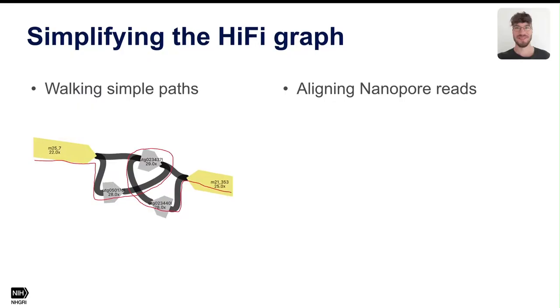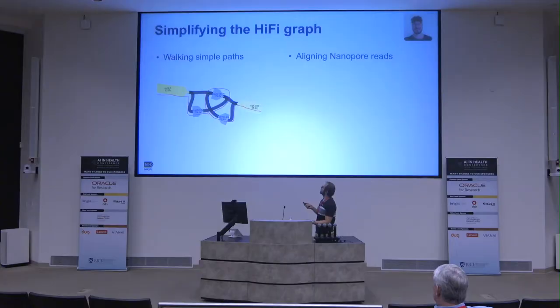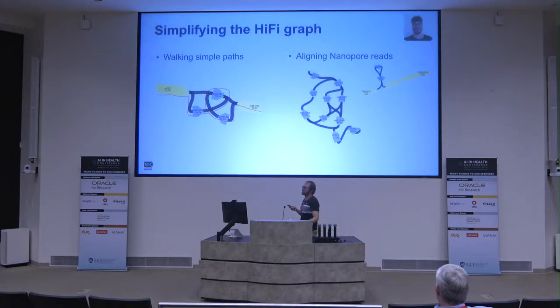The ONT data can help guide you. But in this case, you could actually do that from HiFi data alone because this is a unique traversal. There's no other way to use every node here, assuming you want to use them all once, right? And you don't have to use every edge because remember the edges are just similarity. So by skipping this edge, I'm not skipping any sequence because the sequence that's covered by this edge is in this node and in this node as well, because they share sequence already. So that's an example where you don't need ONT data.